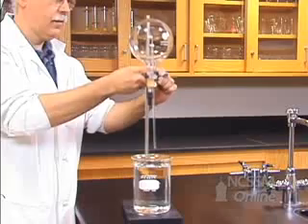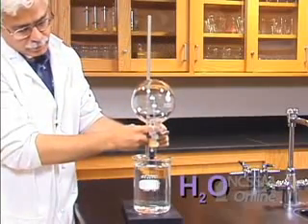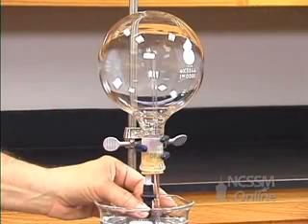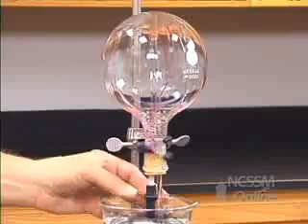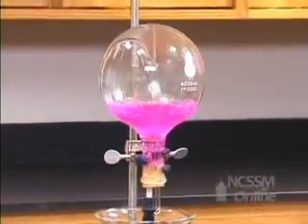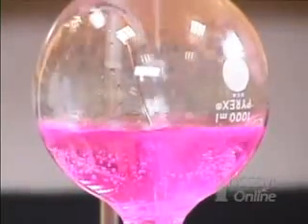We're going to lower the tube connected to the round bottom flask into a large beaker of water. We're going to inject the water from the dropper into the flask. The ammonia gas is very soluble in the water and very rapidly dissolves in the water, creating a low pressure situation inside the flask.